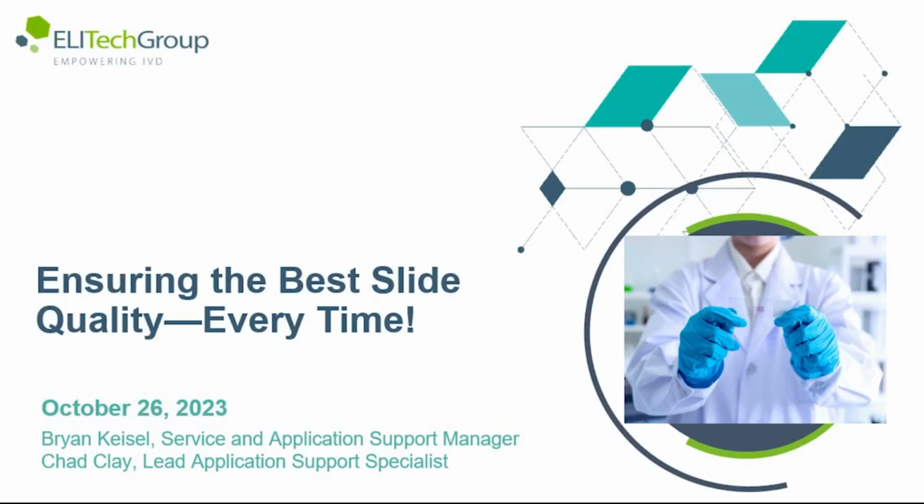Hello, my name is Bryan, and I am happy to be going over some of the best practices for slide staining. I know everyone's got a little bit different background, so I'm going to start off with just some of the very basics and go through some of the things that we use slide staining for. And then after, Chad is going to go through some of the more details on what types of things we see that causes issues and the things we see that are best practices that can help ensure we have the best quality slide every time.